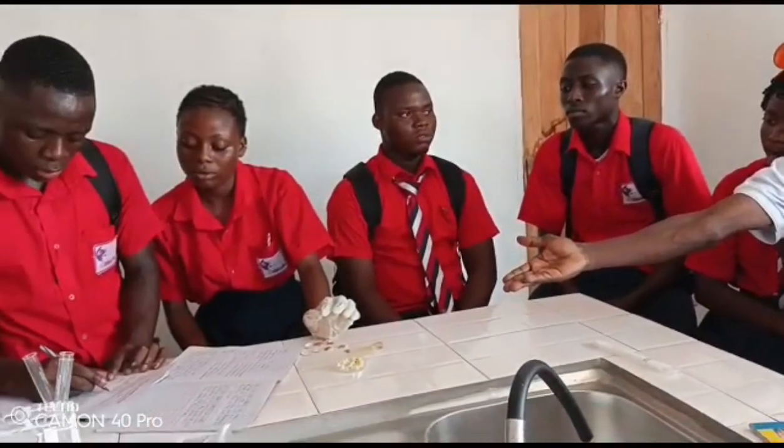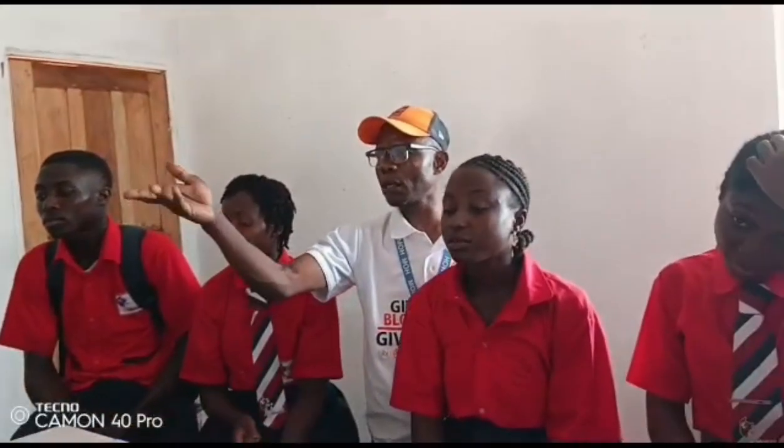So conclusively, in the knowledge of our students, what we understood today is that there are some foods we eat, and we discussed the different types of food; we have 6 groups of food. One of the groups is carbohydrate food. Today we want to detect the presence of carbohydrates within one of our food groups. We brought egg, which is one of our food groups, but egg does not have starch because there was no change in our iodine solution.